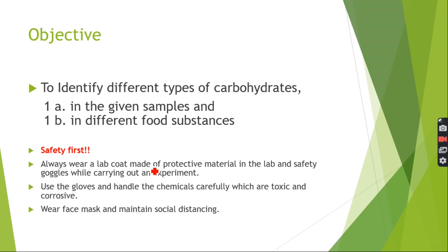I'm sure you must be remembering your earlier courses of maybe general organic chemistry or organic chemistry 1 and 2, and there you may have identified several compounds or different functional groups. So today we are going to perform different types of tests on several samples of carbohydrate. Had it been in our lab, different food substances would also have been used in order to identify the various types of carbohydrates.